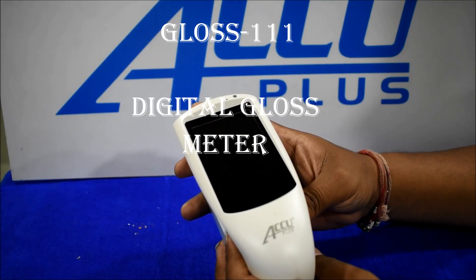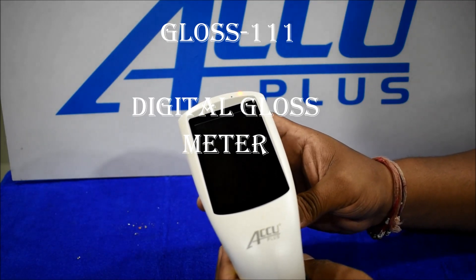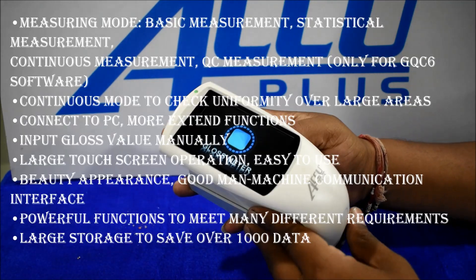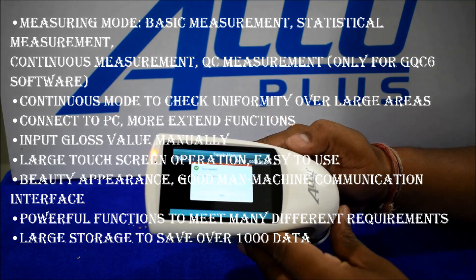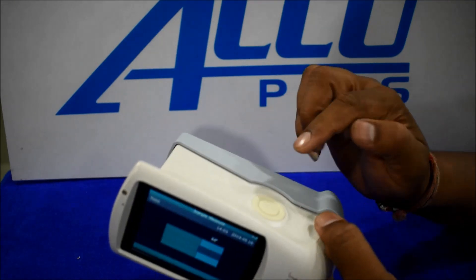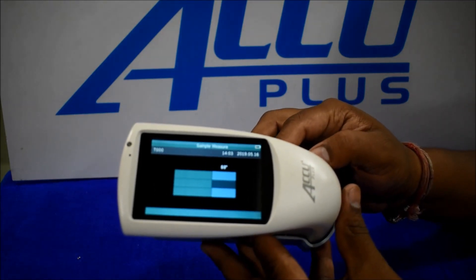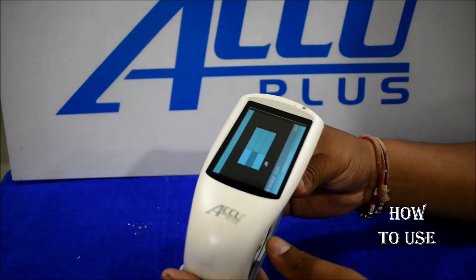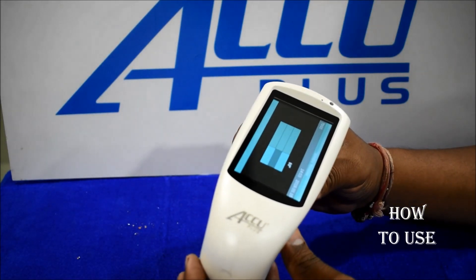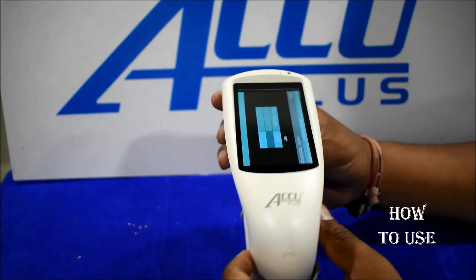Hello friends, we are looking at a digital gloss meter. The code is gloss 111. We have seen this — to turn on, press and long press, then after it turns on, push one time and we got a reading on any product.